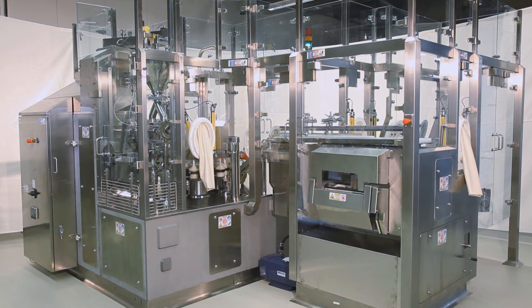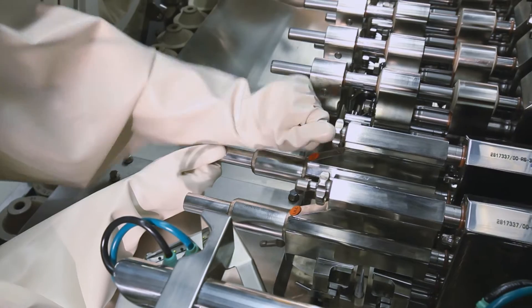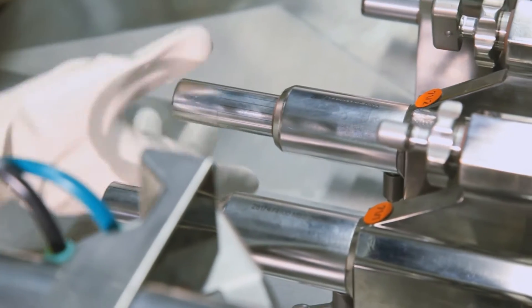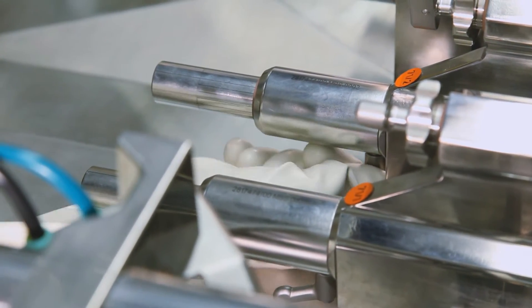As on all IWK machines, the operator has excellent access to the machine from all sides. The locations of the glove ports were chosen so that the operator can troubleshoot the machine without opening the doors. This avoids unnecessary interruption of the laminar flow and the risk of contamination of the filling area.